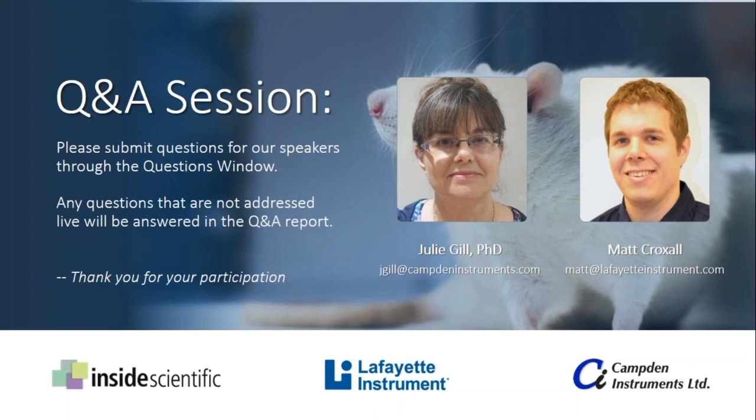Moving along, quite a few people have asked about the age range of mice, for example, that can be used with a system like this. Can either or both of you comment? Is there a minimum, maximum? I'm not sure of actual sizes, but I know that quite young animals have been used, and certain studies have looked at aging mice and rats as well. So I don't have that data off the top of my head, but I believe it is there in the literature. Okay. We can certainly send out bibliographies to everybody.